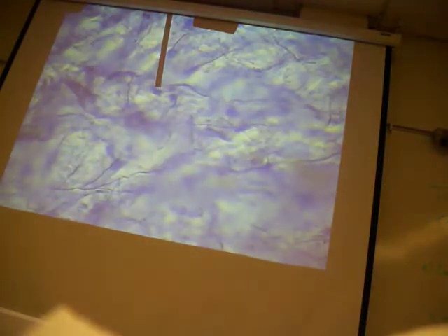Your answer in this case would be fibroblast. Or if the question was, name the cell at the tip of the pointer, here's a mature one, your answer would be fibrocyte. If it's responsible for breakdown, then you would write fibroclast. Does that make sense to everybody? I will give you a hint as to what answer I want you to record for this.